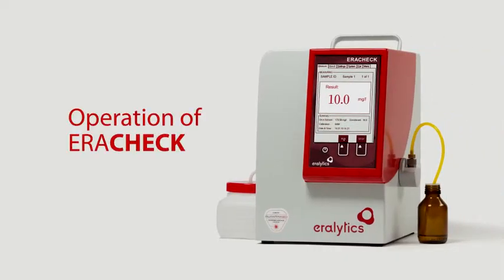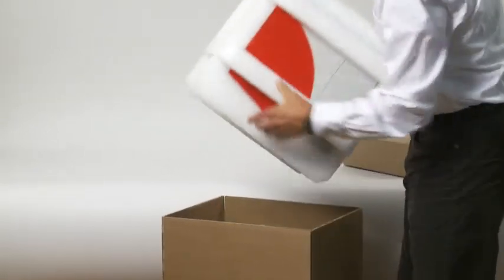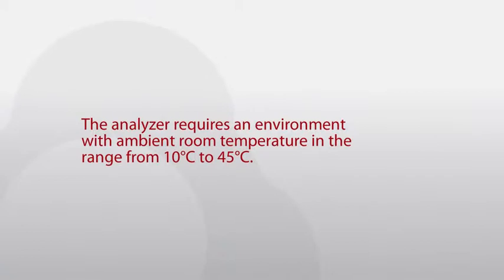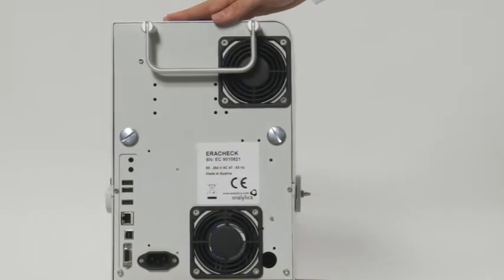After unpacking, place the instrument on a stable benchtop. Make sure that the vent holes of the analyzer are not obstructed. The analyzer requires an environment with ambient room temperature in the range from 10 to 45 degrees Celsius. Turn the instrument and connect the power cable to the plug on the rear side of the instrument.